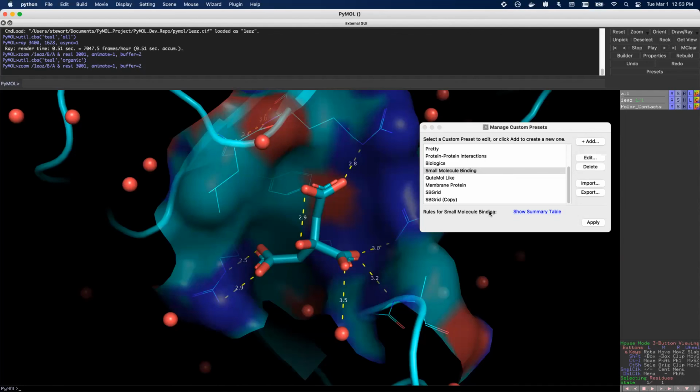Yes, definitely. So the actual CMD set command, I'm pretty sure that's what it is. One of the optional arguments is a selection within that. Not all settings respect that selection argument, but many do. That's one thing that I've found when working on the presets panel, actually. I'm pretty sure, I want to say label size does respect the selection, but there's particular other things that are more rendering focused, I guess, like shadows or ambient occlusion or something. That does not.